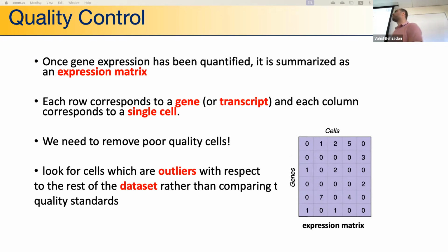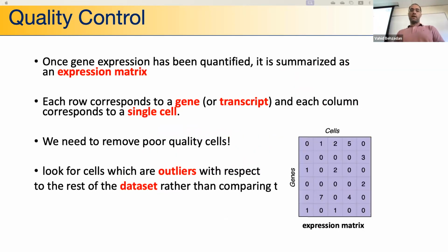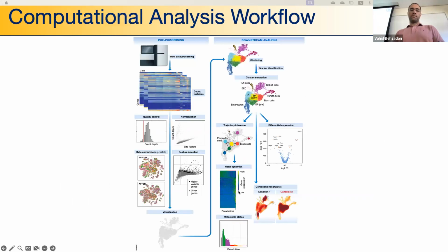Go ahead. What's the objective? Yes, the objective is here. Let's go to this slide. So usually you get more than 25,000 genes in the human body, right? That's a lot of data, and many of them are not informative. What's the end goal of this entire pipeline? Trying to model correlation. Yeah. From genes to traits. Yeah.